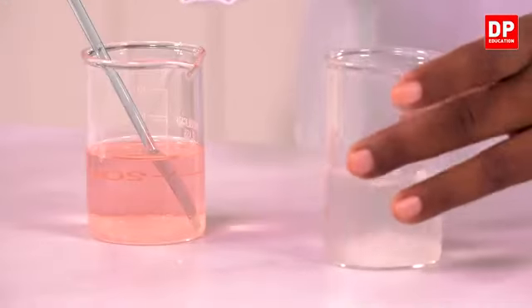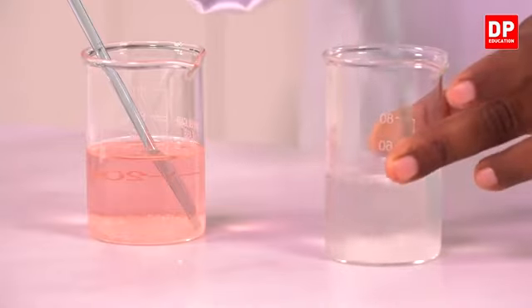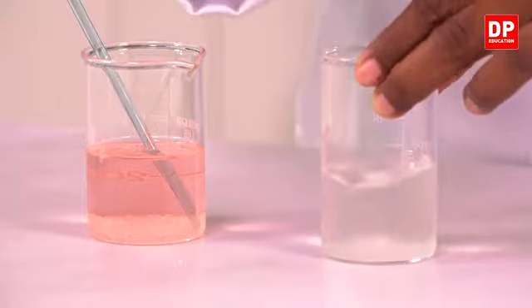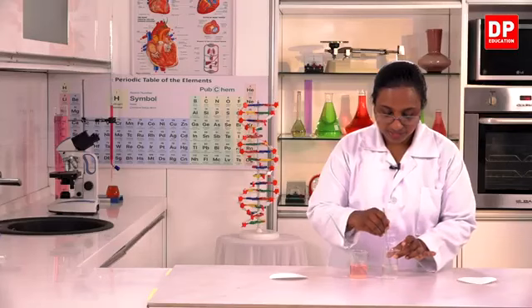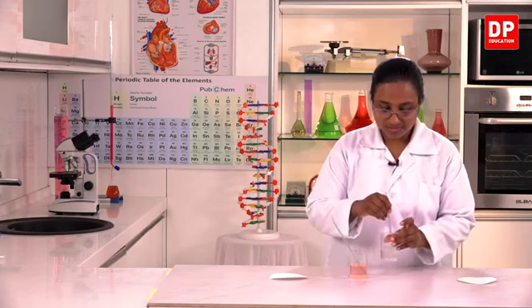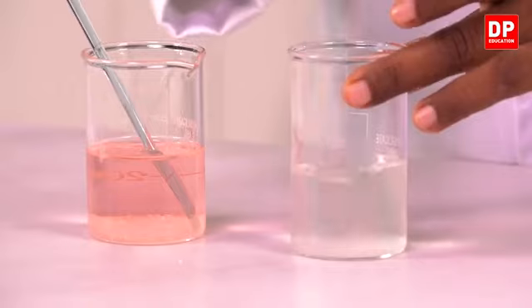So here you can see it's only 5 grams of sugar. I will try to dissolve the sugar in water. You can see it dissolving and you can see it's a clear transparent solution.